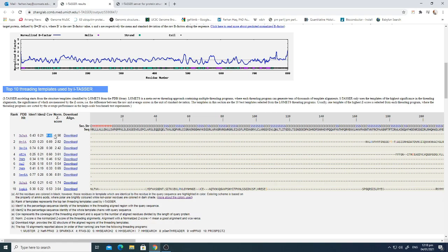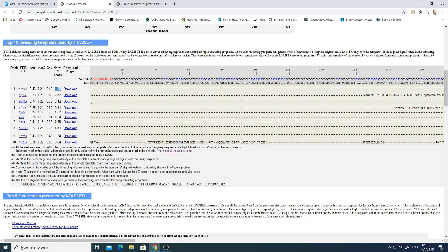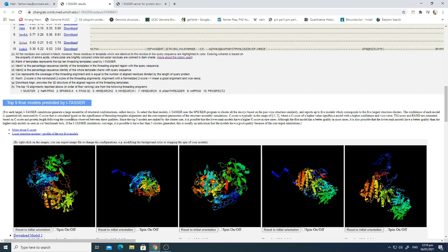The normalized Z-score is very important. The description states that an alignment with a normalized Z-score greater than 1 means a good alignment, and vice versa. Here, the alignment is greater than 1 for most structures, meaning the alignment is good — except for templates number 5, 6, and 7, which are less than 1.